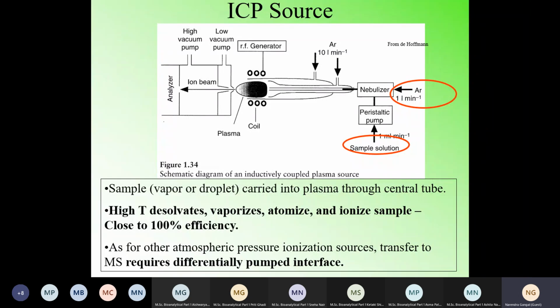Again, let us suppose my substances are at a very high concentration, in terms of, say, percentage or ppm. Then ICP-MS is not the technique, because there are many cheap techniques available. I may use normal flame photometry, typically for alkali metals, or I can use atomic absorption easily, or I may use ICP-OES. I need not use ICP-MS.